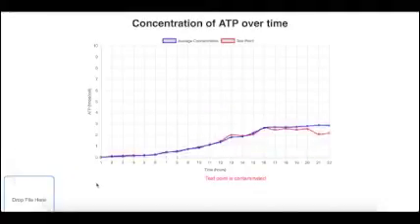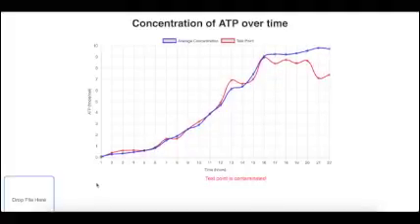Our second test is a sample we artificially contaminated at hour 10, and as you can see, it is categorized accordingly. Eventually, the end user will be able to log into our server and see a % chance of contamination of a specific contaminant.